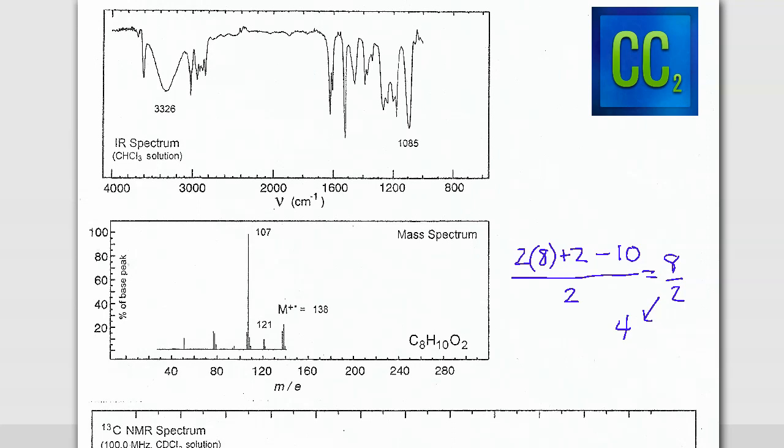Now, just seeing that, that's either a lot of double bonds or rings in a system, or there's very likely an aromatic compound. So whenever you see 4 or more degrees of unsaturation, you just mark down that you probably have an aromatic compound of some sort. It's not a guarantee based on just degrees of unsaturation by any means. However, it's usually a good guess.